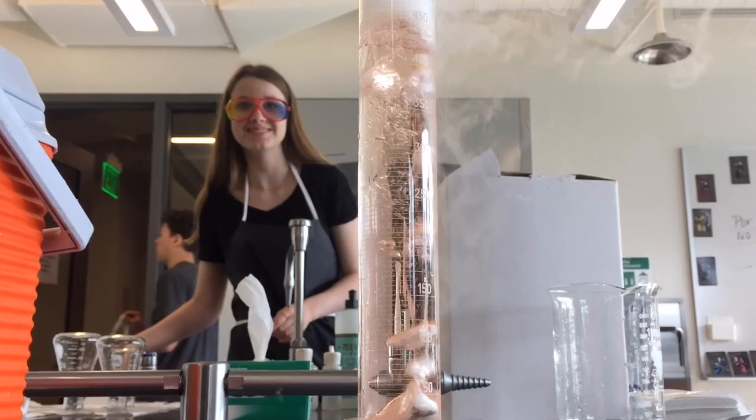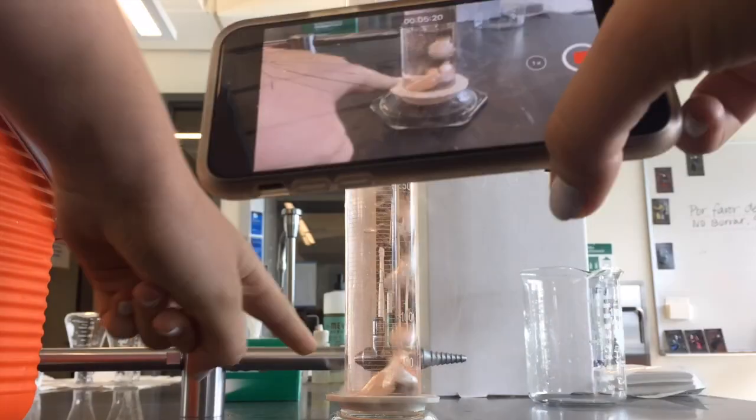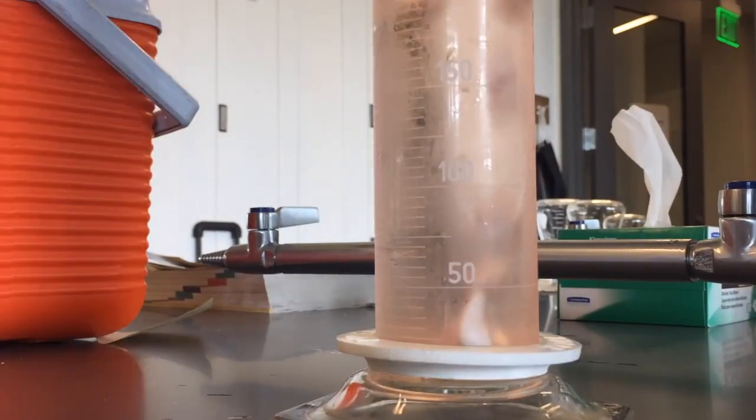Oh, that's me. You're probably wondering how I ended up in this situation. Well, it all started when we decided to demonstrate how the pH of a water-based solution changes when you add a solid carbon dioxide to it.